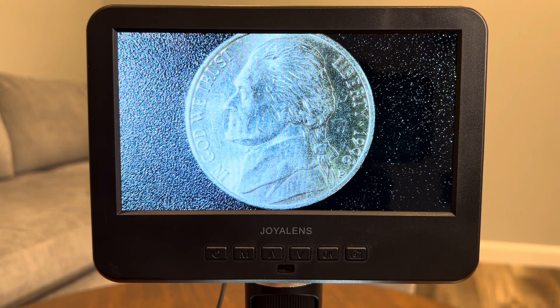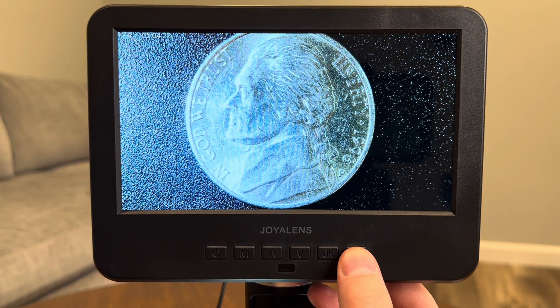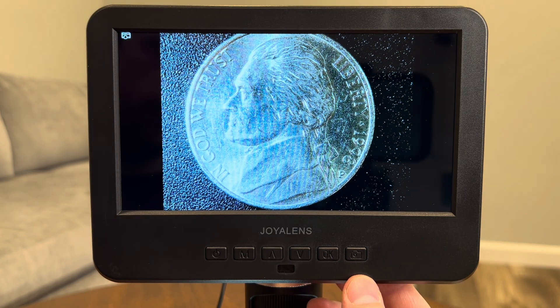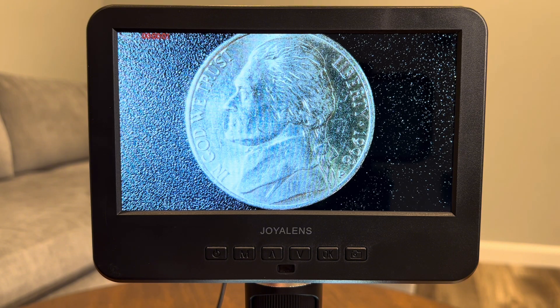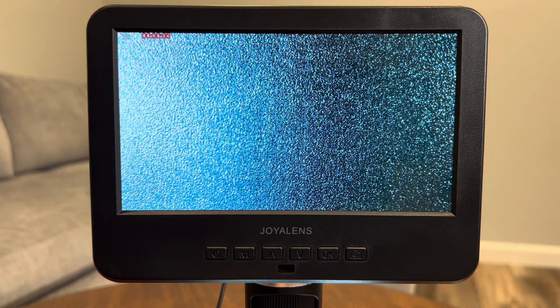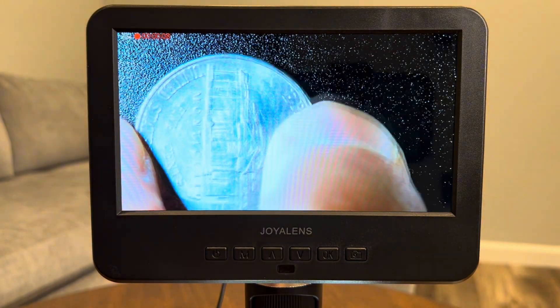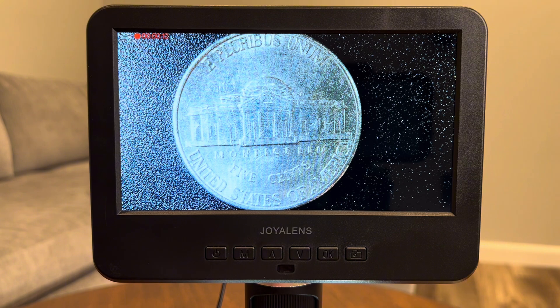Having full control over the lighting makes a big difference when you're trying to capture fine details. The microscope also has a built-in camera, which lets you capture both photos and videos directly from the device. To take a picture, you simply press the capture button on the screen or on the remote control. To take a video, you press the start recording button on the display or on the remote. The quality is pretty impressive, especially for a microscope in this price range. You can easily save your files to an SD memory card and transfer them to your computer for editing or sharing.